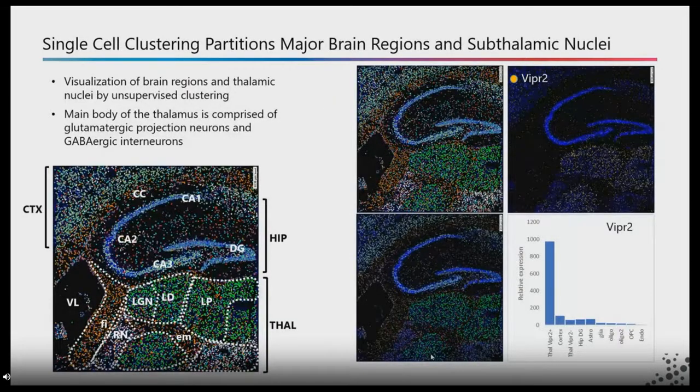One of the things that we have done is to simply look at the data and see what it tells us. And one of the things that is striking to me is that given these panels and the clustering tools, one can actually begin to see substructures in the brain that are only evident by careful neuroanatomical mapping. So with the cell typing ability and the clustering, you can see subdivisions in the thalamus quite clearly, as indicated on the left-hand panel there.